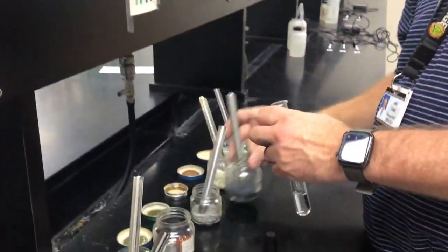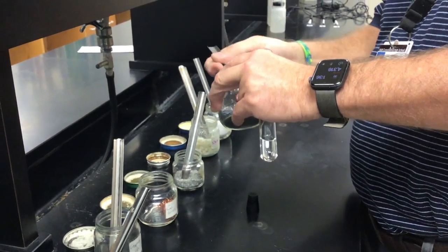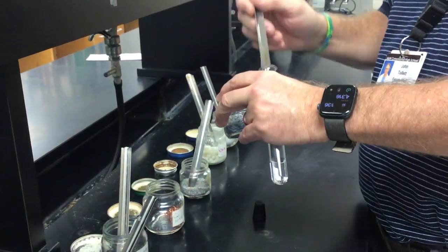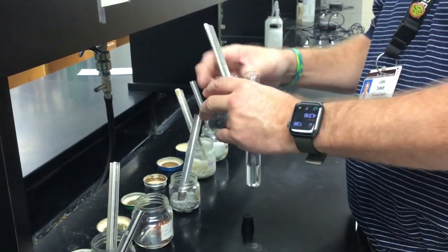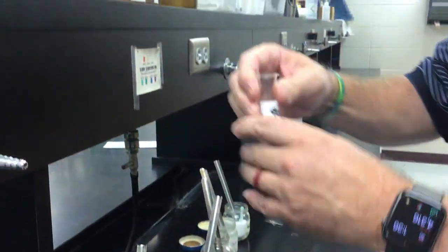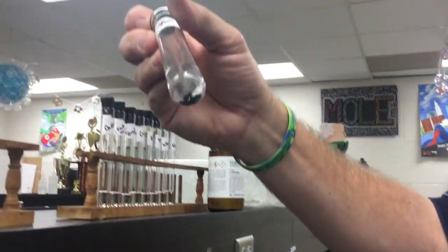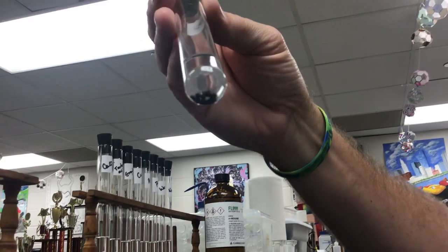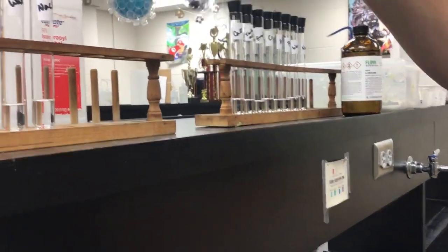Next we'll do the lead. Well, this lead's just going to roll off this scoop. Let's see. It's rolling. Okay, there's some lead. And I'll shake it up. You can see the lead down there in the bottom. Is it soluble in isopropyl? Can you hear it? You can probably even hear it.